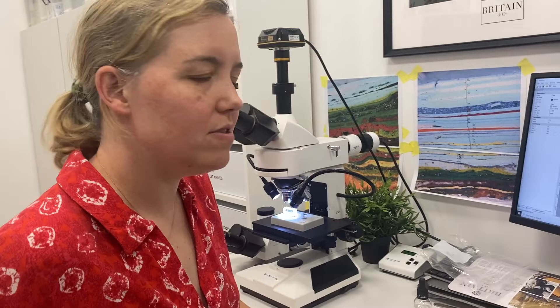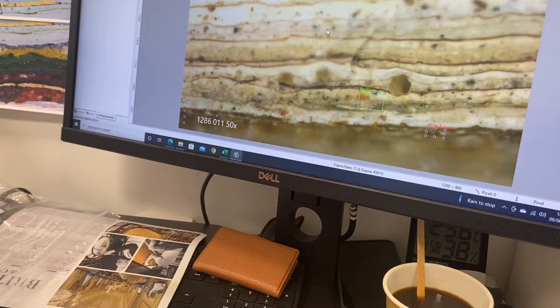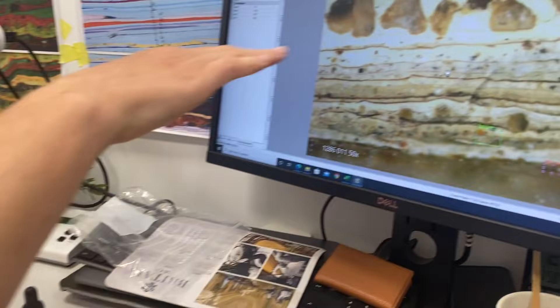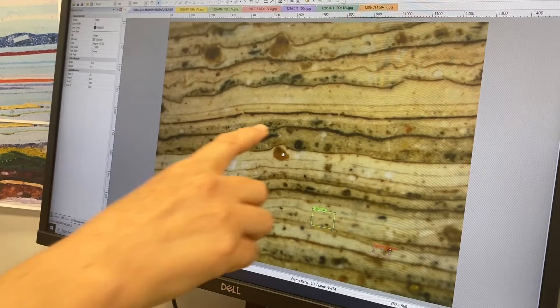So these are all — that's the very earliest one there. We've just got a trace of the primer down at the bottom. The microscope has a very shallow depth of field, so just about able to see that there while refocusing. The dark lines are sometimes little breaks in the sample and sometimes it's dirt. Further up here we've got some varnish layers that go thicker.